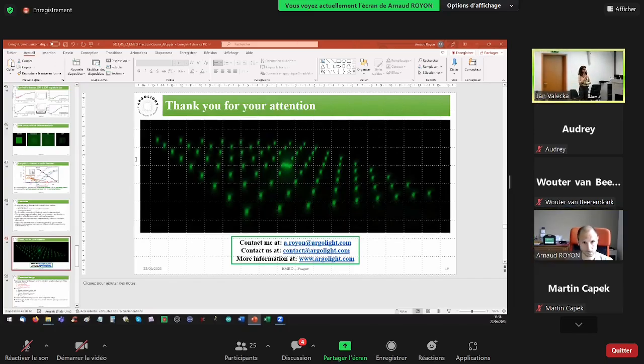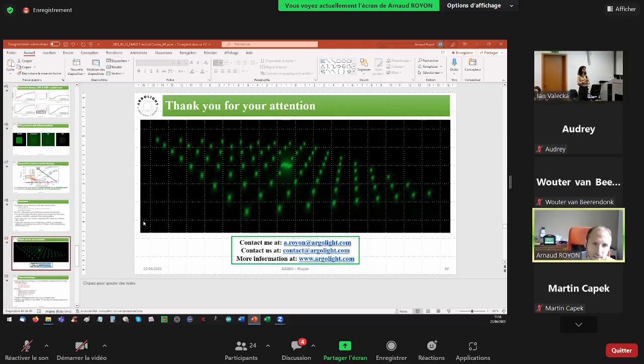Yes, there's a question from our virtual participant. Is there a way to account for sample refractive index while analyzing Argolight patterns, for example by entering a range of values in the analysis software and visualizing how it affects resolution, signal-to-noise ratio, and so on? So actually, no, it's not possible.